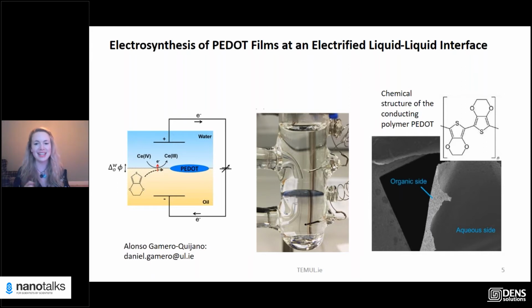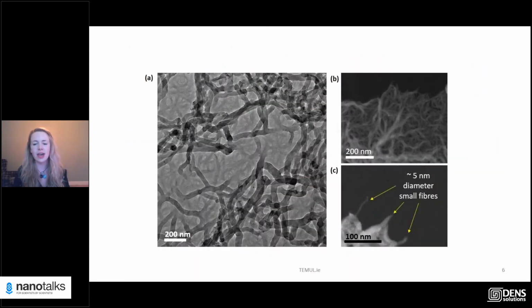So I want to get my hands on this and also questioning, is it really amorphous? So we moved on from that and I took it in the microscope. We had a look, and when you start magging up and being able to see better resolution, you can see it's actually made of interwoven, tight-knit fibers. And from what I can see, down to around 5 nanometers, possibly even less, but that's further studies.